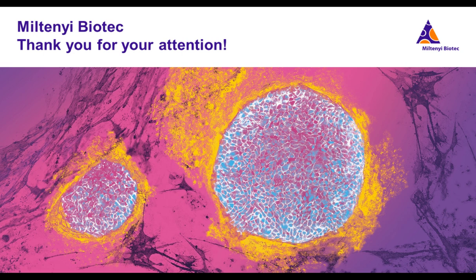Can we use any other desirable marker? Yes. As I mentioned in the presentation, the platform is an open platform regarding the antibodies. There are just some prerequisites to consider. You need primary conjugates of an antibody. So that means we need, in this case, primary antibodies coupled to a fluorochrome.